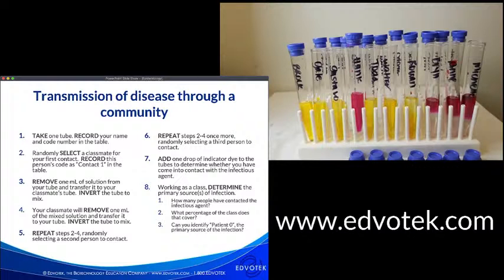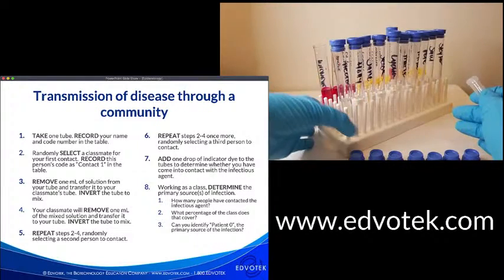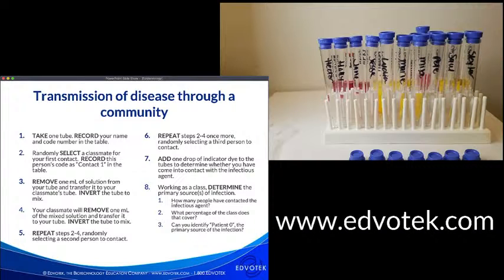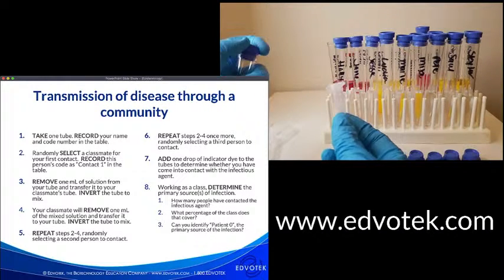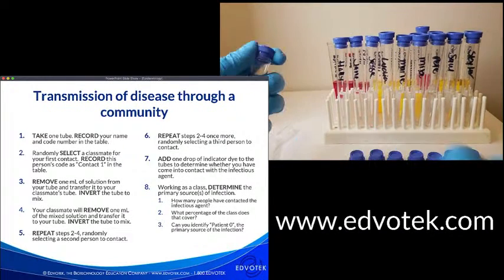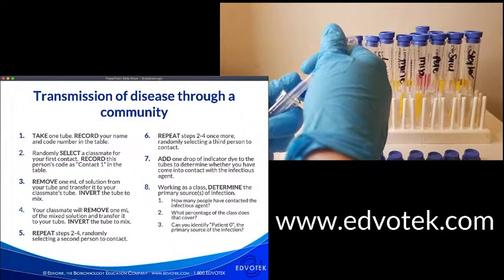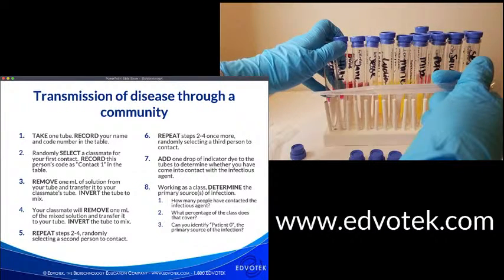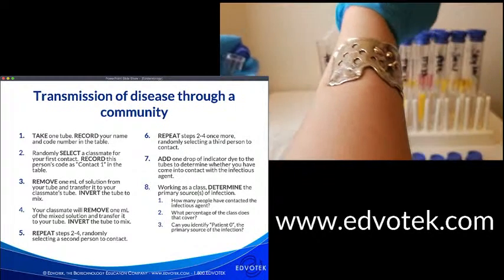And so what we would do is, instead of, let me turn my samples around. All right. And so what we would do here would be, instead of removing our samples into separate tubes before performing the experiment and making the exchange of fluids through the tubes, we would remove the sample right from here. We would place it in another tube. So, we would do this, we would remove this, and we would just exchange the fluids directly.